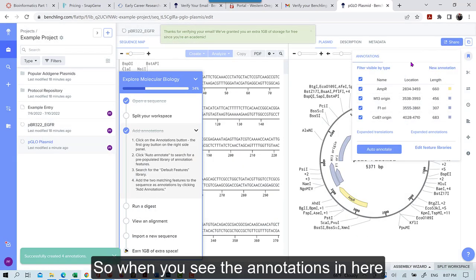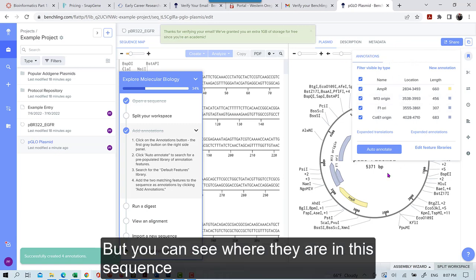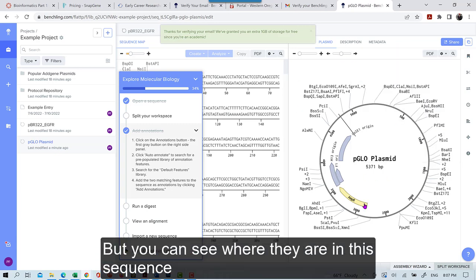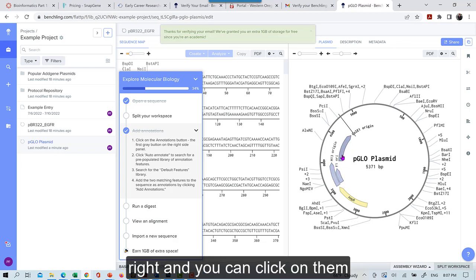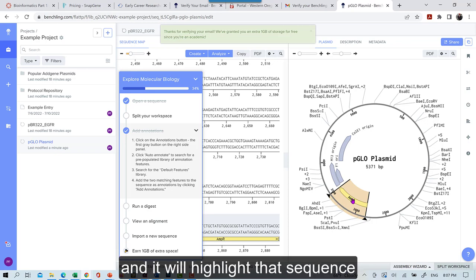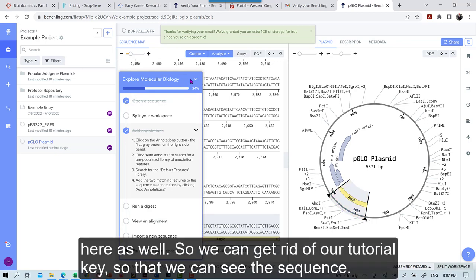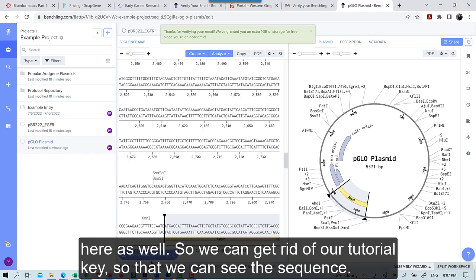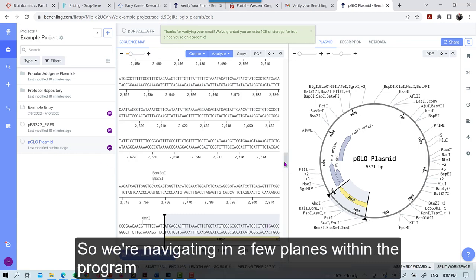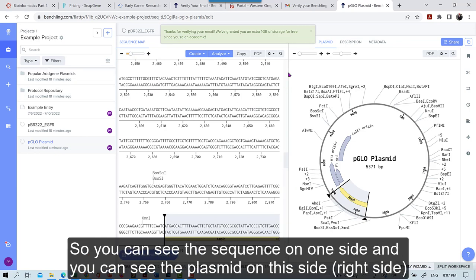So when you see the annotations in here, but you can see where they are in this sequence, right? And you can click on them. And it will highlight that sequence here as well. So we can get rid of our tutorial key so that we can see the sequence. So we're navigating in a few planes within this program. So you can see the sequence on one side and you can see the plasmid on this side.